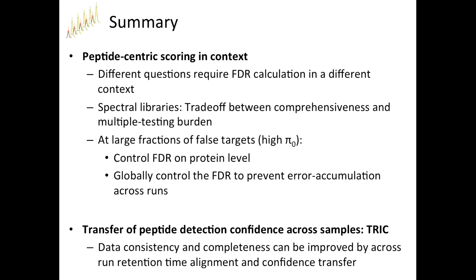And finally, you can use the TRIC algorithm to increase the consistency and completeness of your data matrices by using this retention time alignment across the runs, and by transferring the confidence of your identifications between the runs.